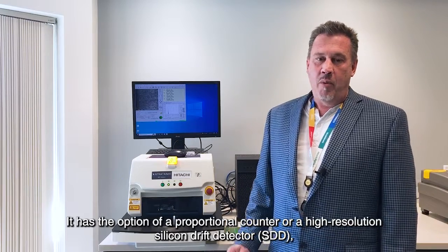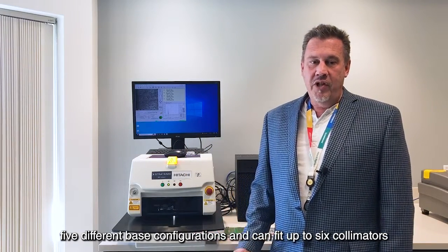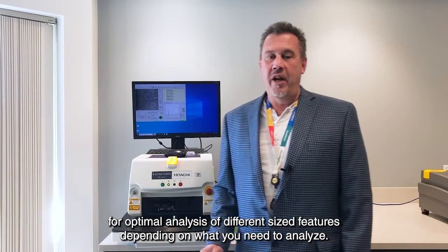It has the option of a proportional counter or a high resolution silicon drift detector, SDD. Five different base configurations and can fit up to six collimators for optimal analysis of different size features, depending on what you need to analyze.